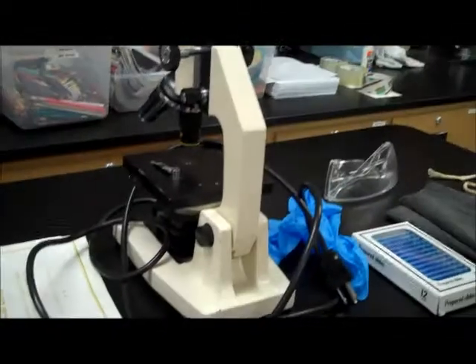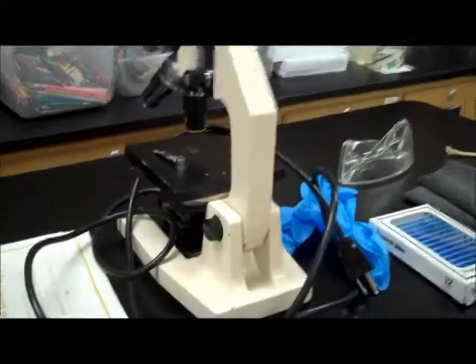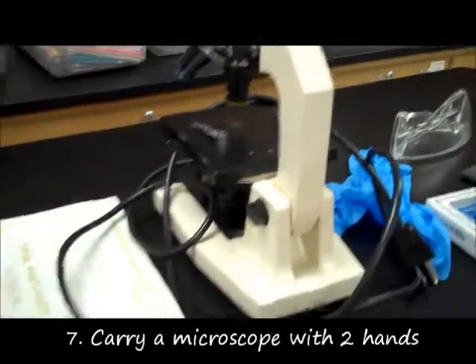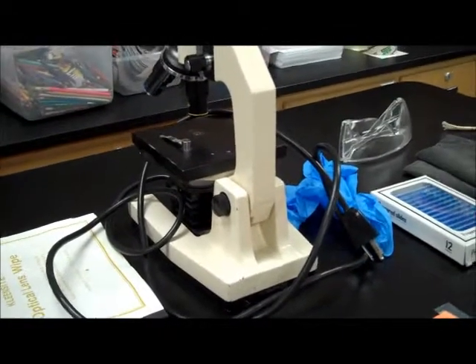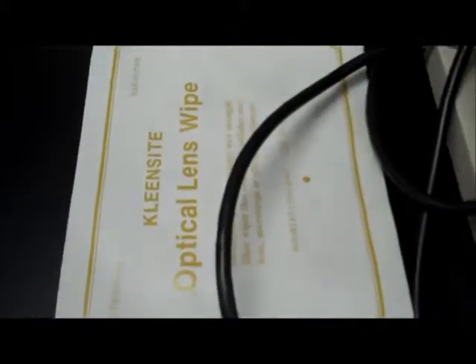In the fourth situation, you also just finished a lab and are ready to clean up. The important thing to remember here is that when you're carrying a microscope, you should use two hands, one hand on the neck and one hand on the base. Because they're easy to drop, they're very heavy, so make sure you walk with two hands. You carry them with two hands when you're walking with the microscope. Also, when you're done using a microscope, you should clean it with lens wipes so that the lens is clean for the next group.